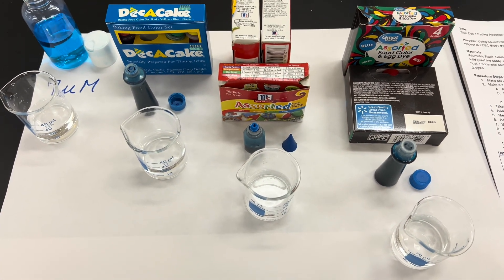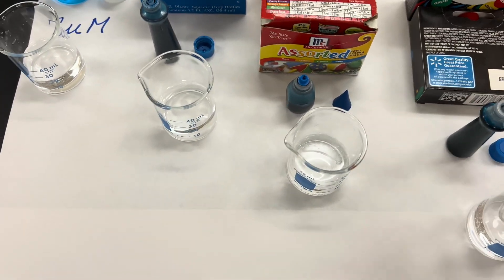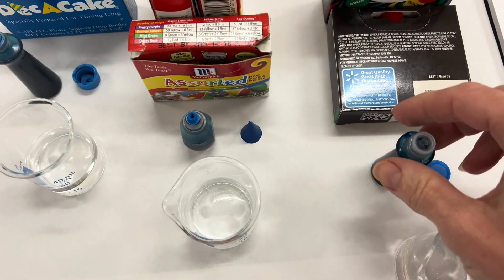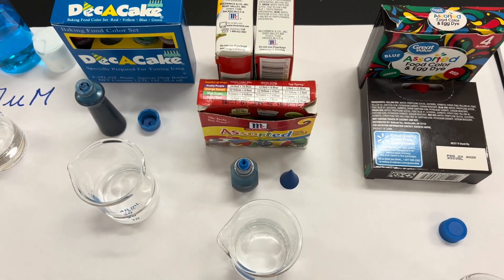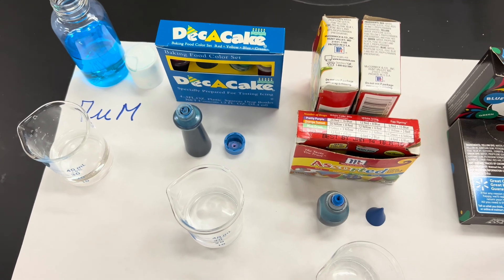Let me show you what happened and let you analyze what you think is going on. Starting with the Great Value — these are all blue dye, at least they say they're blue dye.